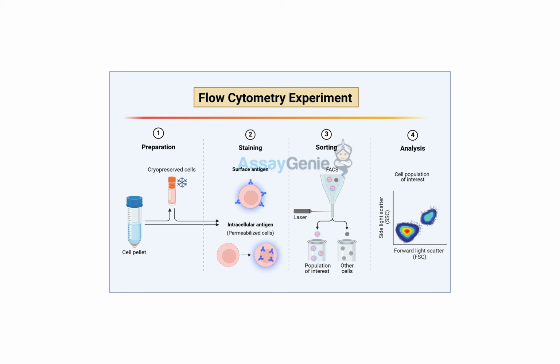You can look at proteins and signaling pathways and even gene expression, all at a single cell level. It's pretty amazing. It's like having a tiny detective working on the case for us. Microscopic detective. Exactly. So for this deep dive, our guide is an article from Assay Genie. It's called Navigating the Intricacies of Intracellular Flow Cytometry: Key Considerations.